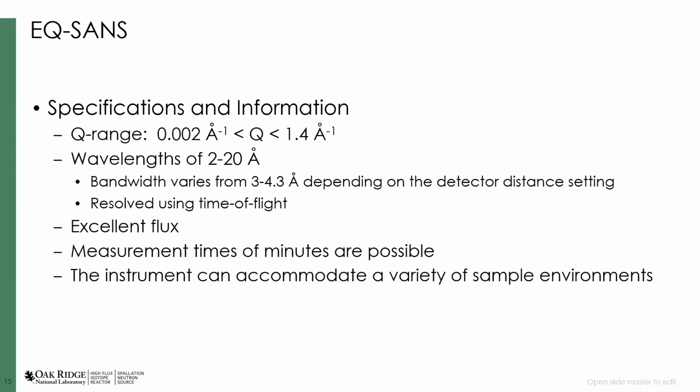So the EQ-SANS, our advertised Q range is 0.002 to 1.4 inverse angstroms.